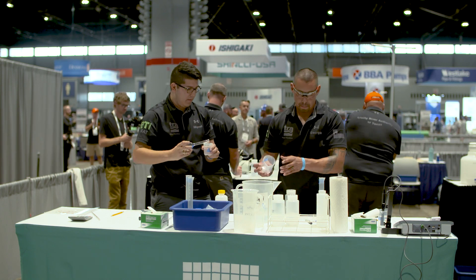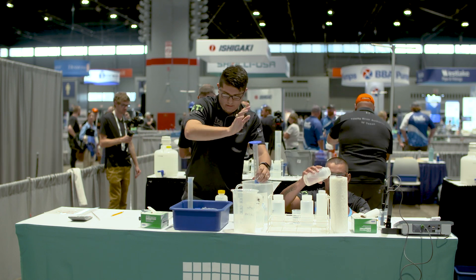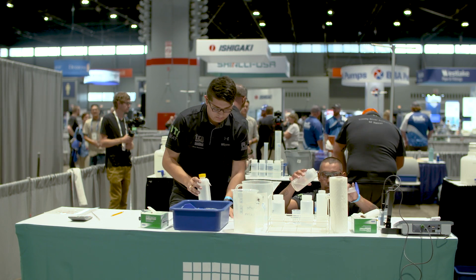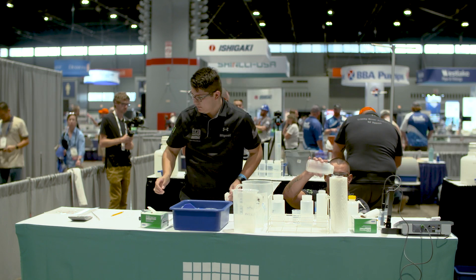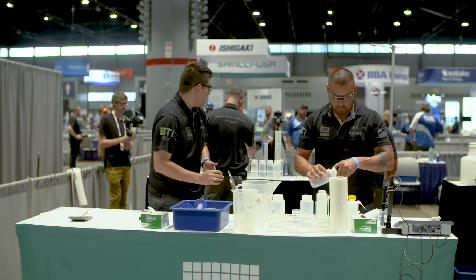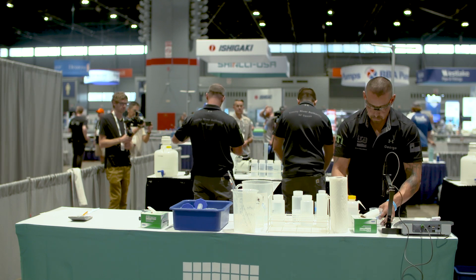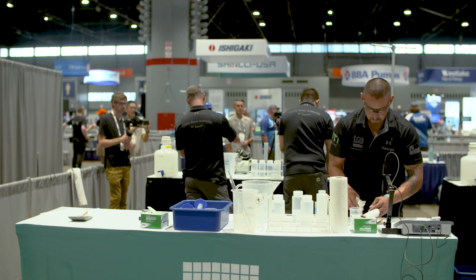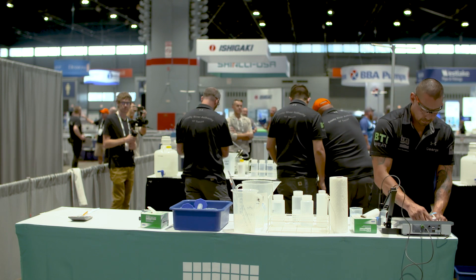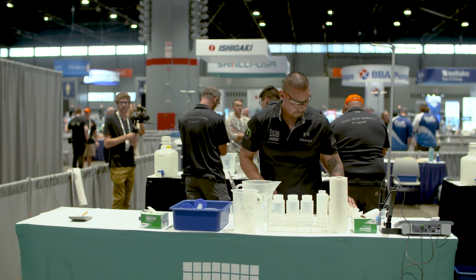Pouring the volumetric into the beaker so he can get an accurate read — that read on the conductivity meter can result in time back, up to a minute. Make sure that the probe is fully submerged in the liquid. Sometimes during the event the probe will get knocked around and not be fully submerged, which will result in a penalty and potentially an improper reading. Just saw the competitor blot and wipe the probe — important. Submerge it so that the slot in the probe is fully submerged.